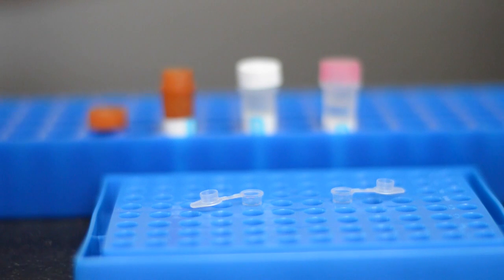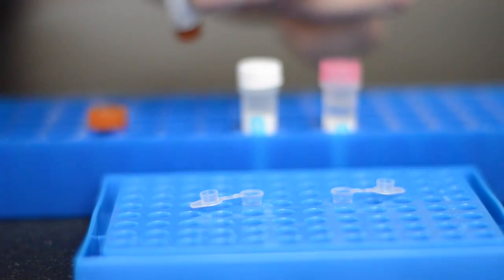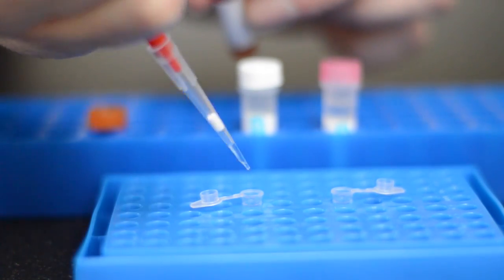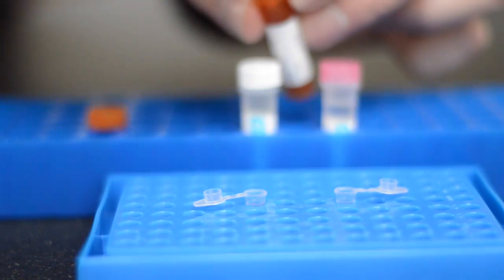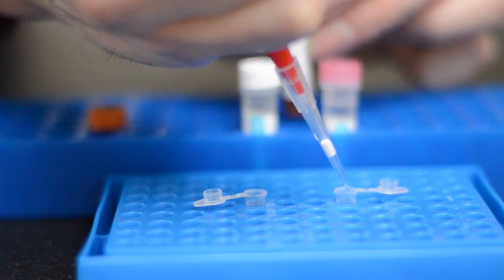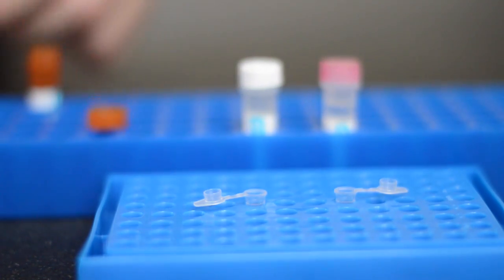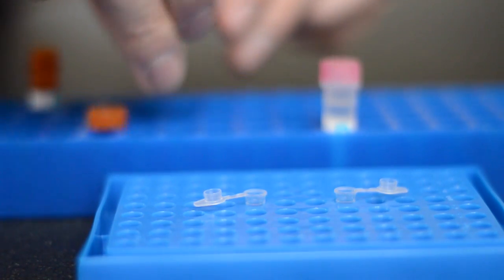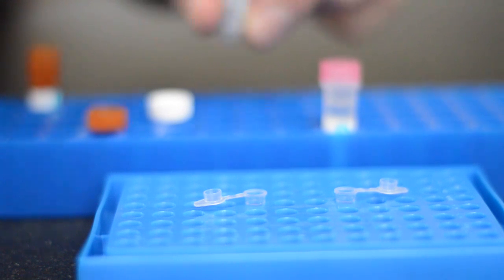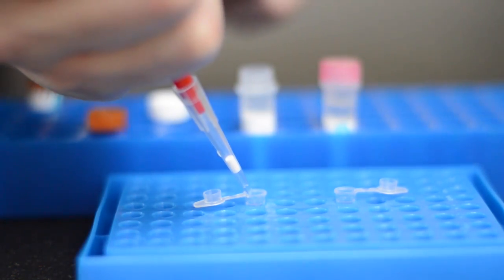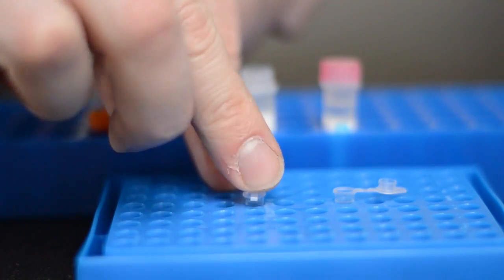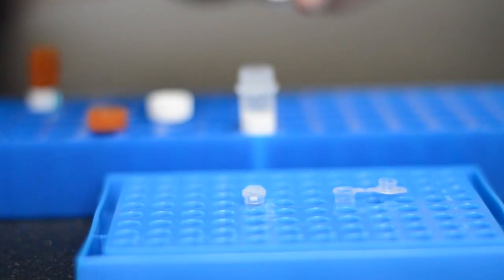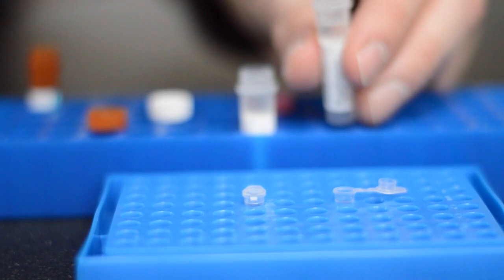Each time you perform a test you'll need to perform a positive and a negative control reaction too. This process is exactly the same but instead of a DNA sample you use water for the negative control and positive control template for the positive control.